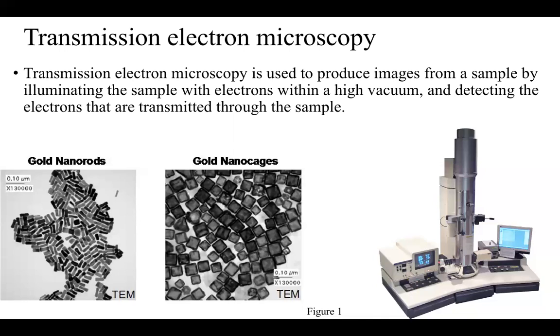We can also perform chemical analysis using TEM. And studying the growth of layers, their compositions and defects in semiconductors are very common applications. High resolution TEM, which means we zoom in, requires the sample to be very thin, less than 100 nanometers. High resolution can be used to analyze the quality, shape, size, and density of quantum wells, wires, and dots, and even the crystal planes.